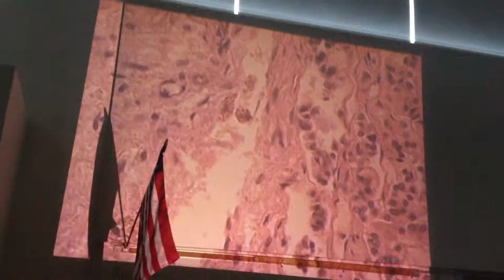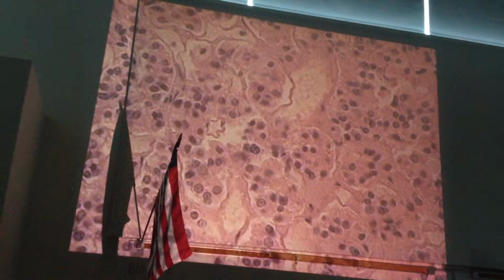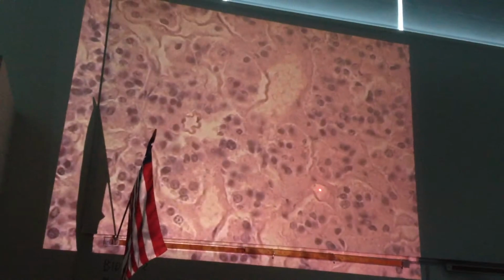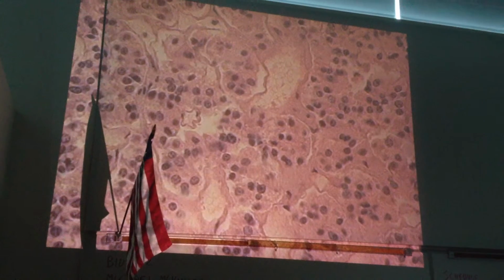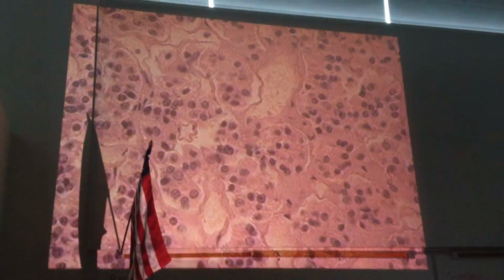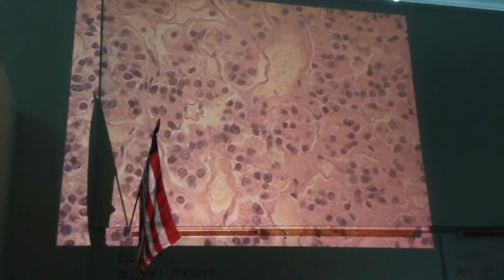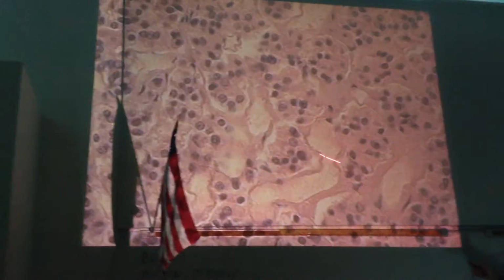So I'm sitting right in the dividing line there. So let me go over to this side. And I think everybody can see. I mean, here's a blood vessel and you can see ghosts of red blood cells there. Same kind of thing that's right here. Same kind of thing that's right over here. And look at the nuclei in these cells because they're little clusters of cells. And as I said, they're almost like simple cuboidal epithelial cells. And they sit there in little nests and they release hormones that we're going to talk about today. And the hormones get immediately into the blood vessels and they're transported through the body. So because of the fact that we see all the blood vessels here, that immediately tells us that's anterior pituitary.